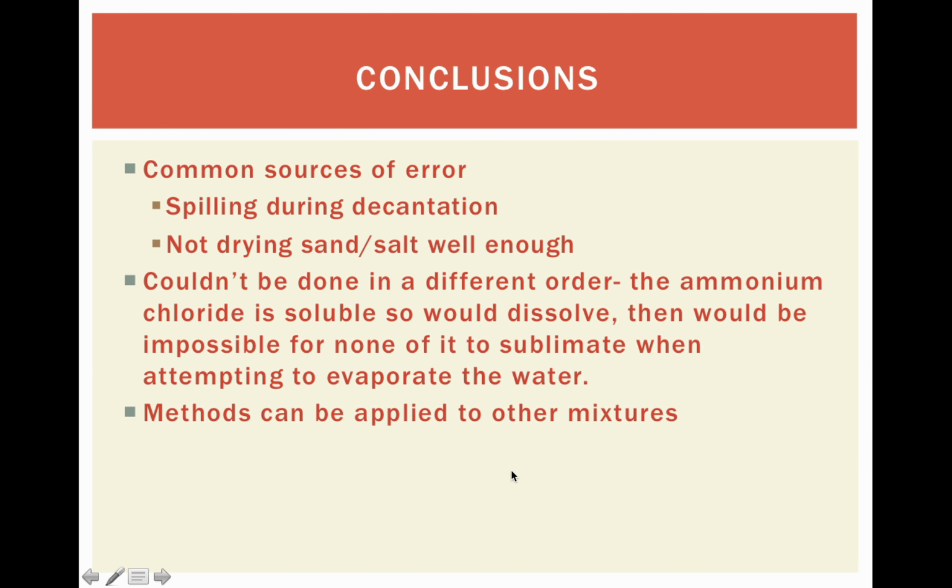And these methods can be applied to a lot of other mixtures. Anytime you're working with something that can be sublimated or can be dissolved and trying to separate it out from something that can't. And that was our lab.